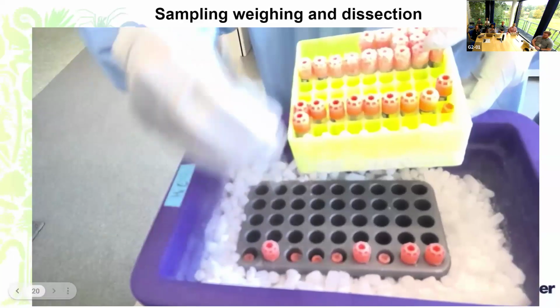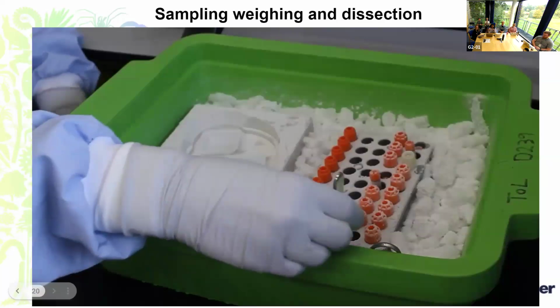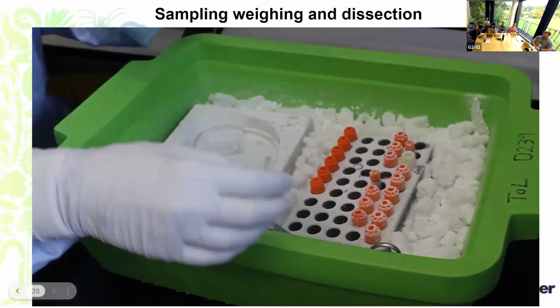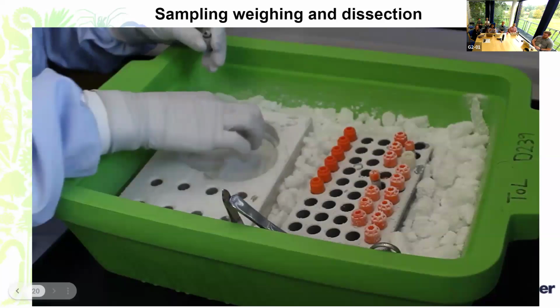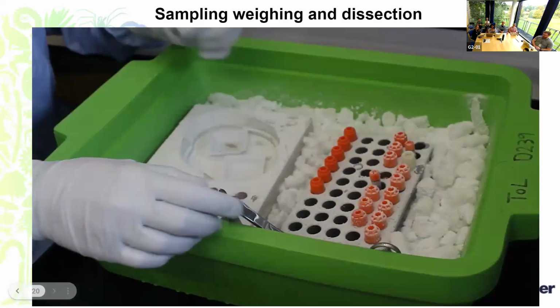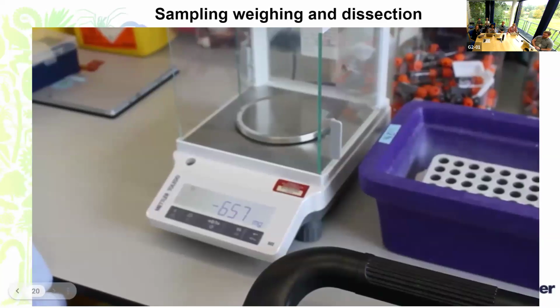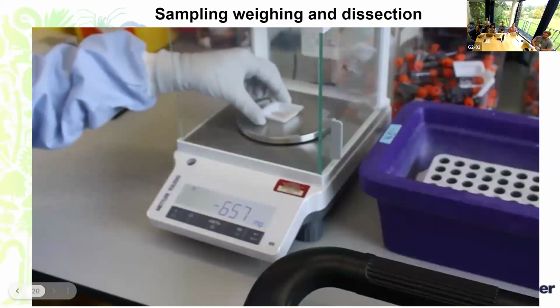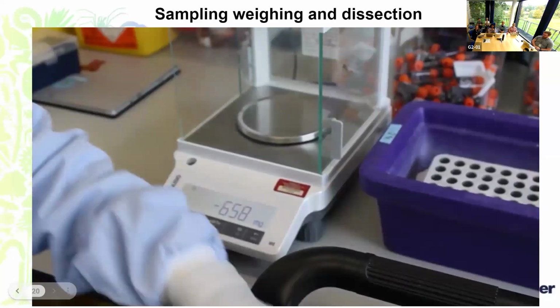While selecting the samples, we make sure what sample and what individual goes through different processes. Once it's assigned, people pick these samples from their workflow and start working on the sample preparation process. So this is the layout we have for sample prepping. We have a specially designed cold rack, or a cold metal table, which is used for the dissection process. Here they are taking the samples out, weighing them, and then based on the weight and the organism part, we decide what downstream process it's going to go under.